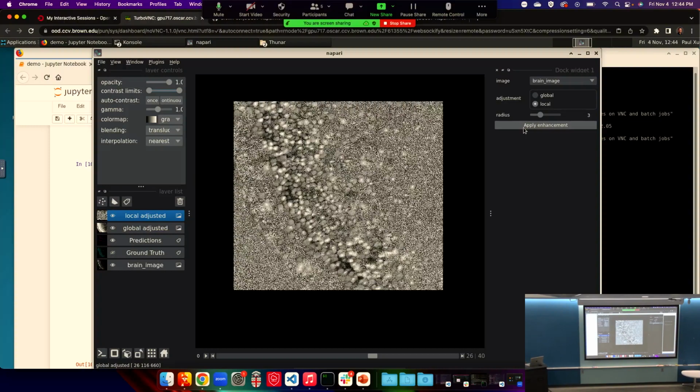So this is a really cool functionality that I think is very, very useful in Napari because basically you can run arbitrary code in Python and allow users an interface to pick different parameters for your different functionalities.